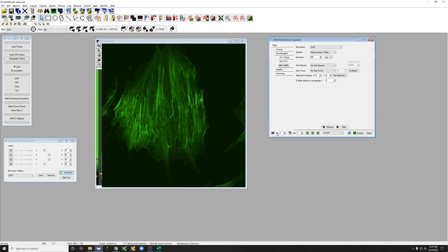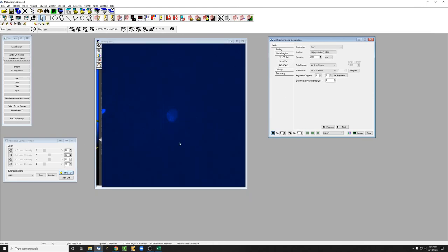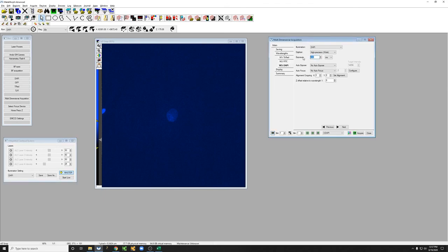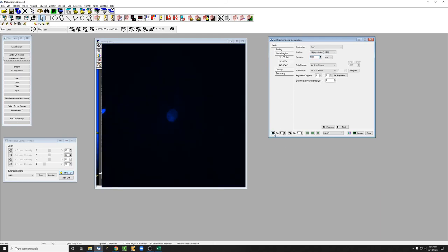And then the DAPI, let's see what this looks like. I'm just going to increase the laser power, increase this a little bit, the exposure. Okay, so there we have reasonable settings that will result in an image.